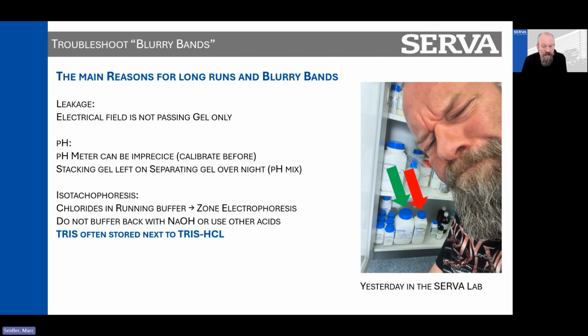There was a question in the last webinar, and I just want to put this in as well: if you can use other acids to make the pH. No, you can't, because now you know, as a watcher of this webinar, it's the chloride that is needed as a fast electrolyte for the isotachophoresis. So if you use other acids, they may be bigger in size or have a weaker pK or something like that, and you will destroy your isotachophoresis.